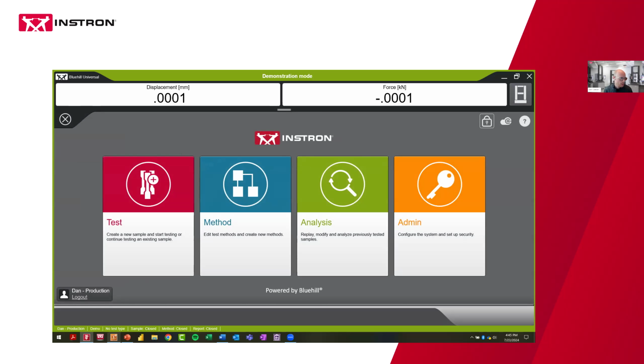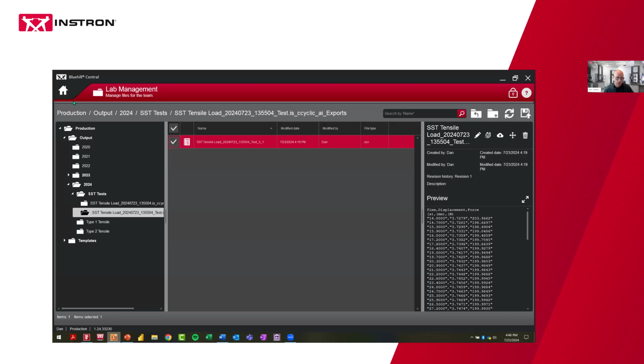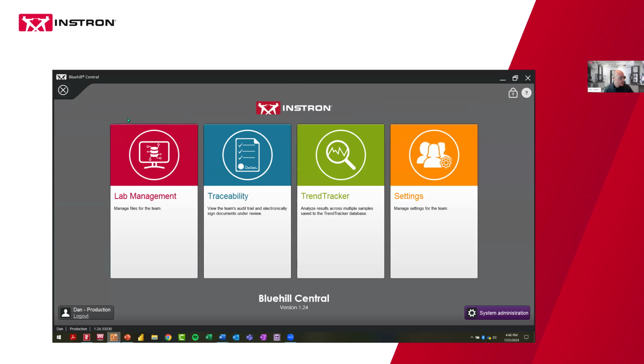Okay, and so I know there's a few different questions. The central part is significantly quicker. So I spent a little bit more time on system suitability than anticipated, but we're just gonna jump right into central and show off these features pretty quickly.